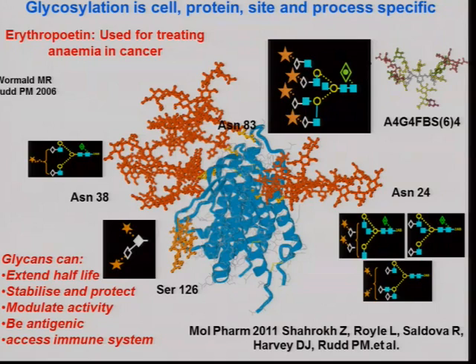In the study where you analyzed the glycan profile, did you analyze the exoglycosidase activity? No, we do it when we get a new batch. When we get a new batch of enzyme, we test it on the IgG profile or sometimes a human serum profile. We just take released glycans that we've analysed many times, and check the enzymes behave as we expect them to. We start off using the number of units that the company says is in the bottle, but if it doesn't work very well, then we have to use more enzyme, or we would optimise it. On the whole, they're pretty good. As long as you don't go outside the sell-by date; otherwise it's at your own risk. It may be fine, but mostly we just run a couple of checks because we like to know what the enzyme digest looks like with that particular enzyme.